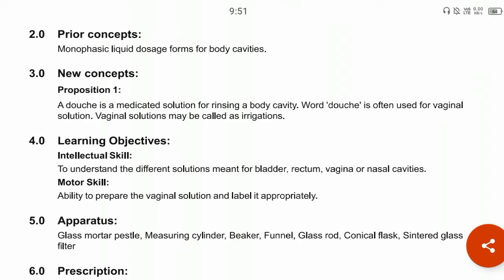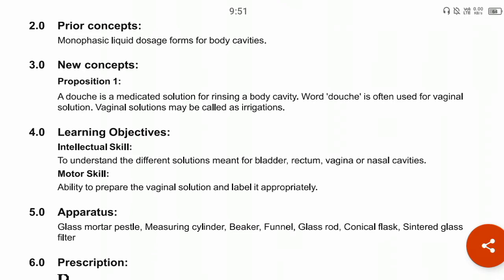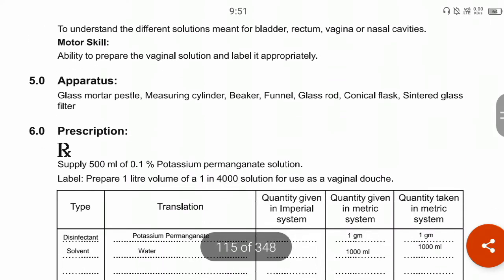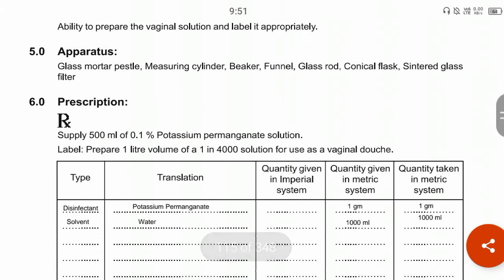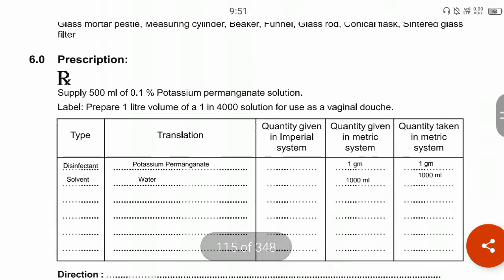The apparatus used in this experiment includes a glass mortar, measuring cylinder, beaker, funnel, glass rod, conical flask, and sintered glass filter. The ingredients required are potassium permanganate, which acts as a disinfectant, antiseptic, and irrigating agent, and water.